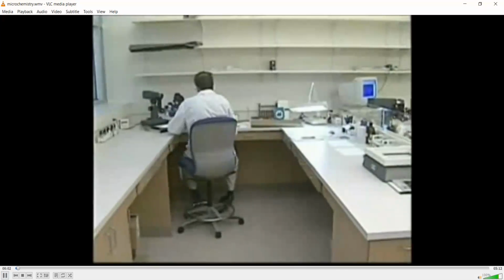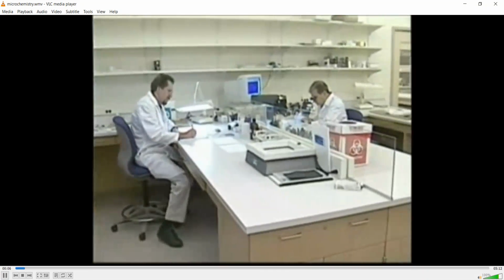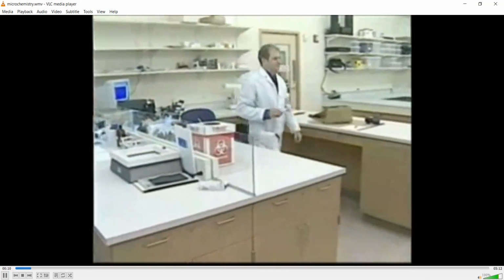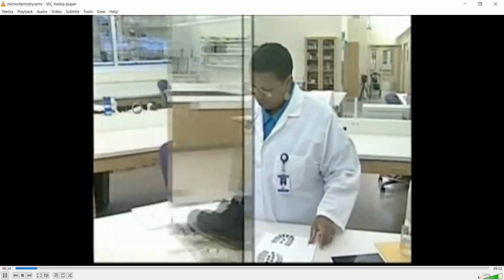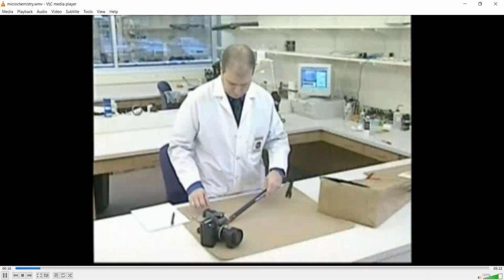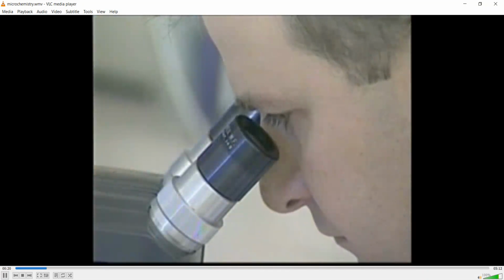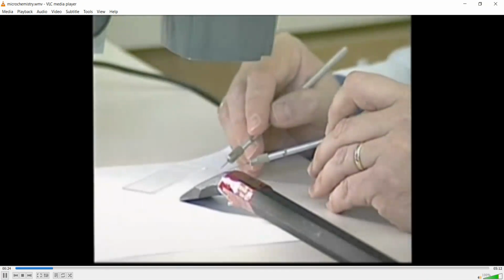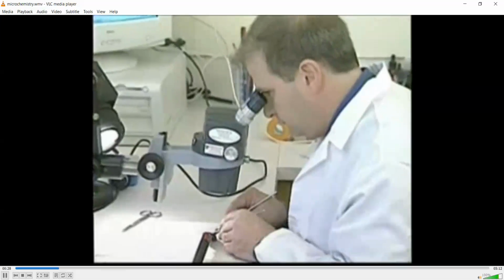The microchemistry unit uses particles coming from or impressions made by manufactured items to associate the item with a crime scene or criminal suspect. Almost any manufactured item can be a candidate. Care and diligence in gathering evidence is very important. Employing a stereo microscope and using instruments as delicate as dental tools, items are examined to discover any trace evidence.